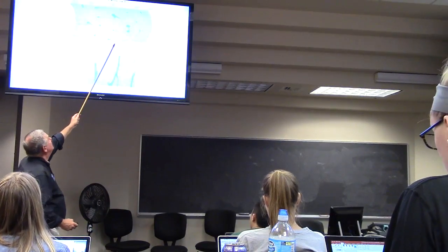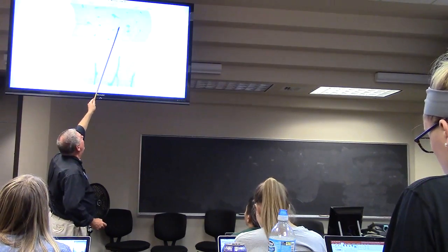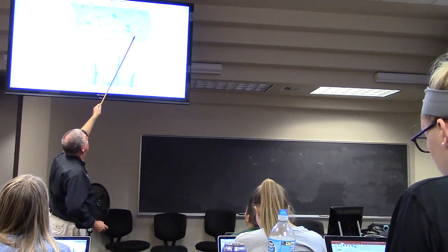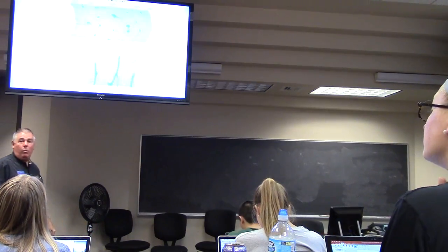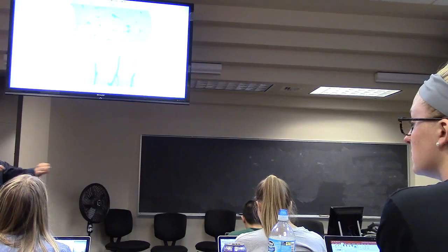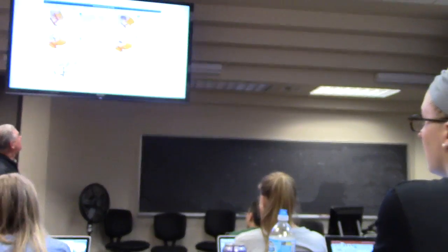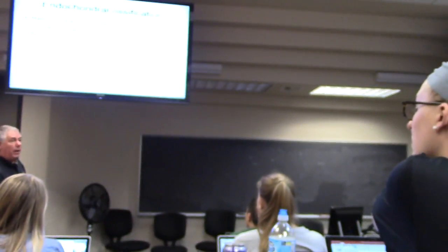So that's what you can kind of see here. Here's a Haversian system. There's another Haversian system. So they just form one beside each other, not on top of each other, beside each other. Okay? And they grow outwards.